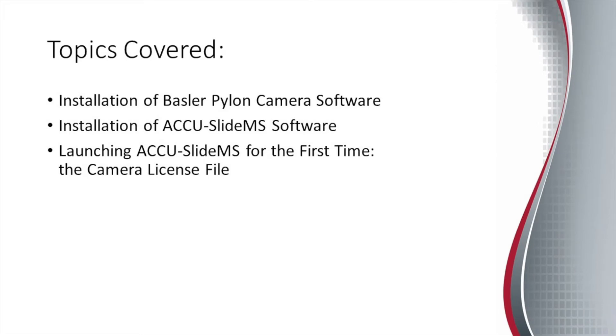Installation of Basler Pylon camera software. Installation of AccuSlide MS software. Launching AccuSlide MS for the first time, the camera license file.